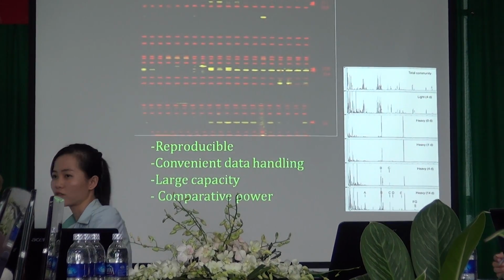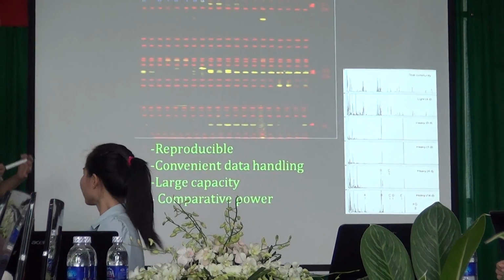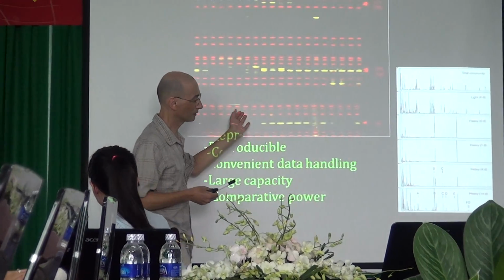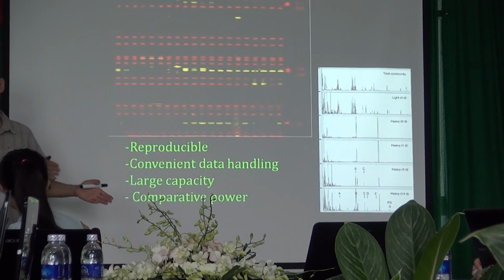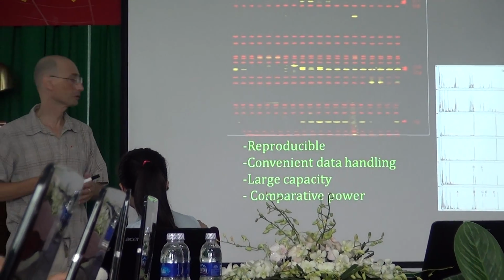It's very convenient for handling the data because all this is automated. So the data that you get out of the TRFLP can be readily transferred into a computer for further analysis.